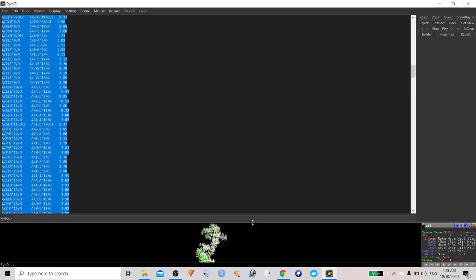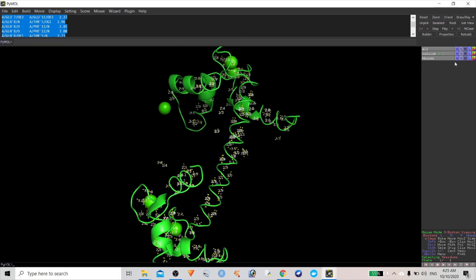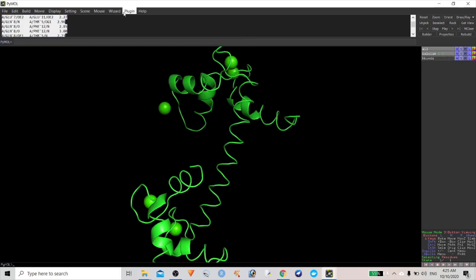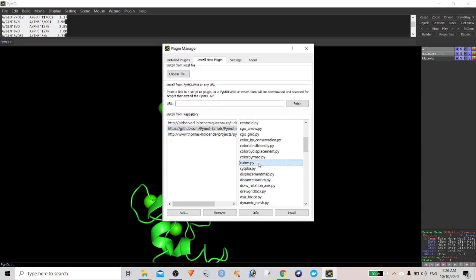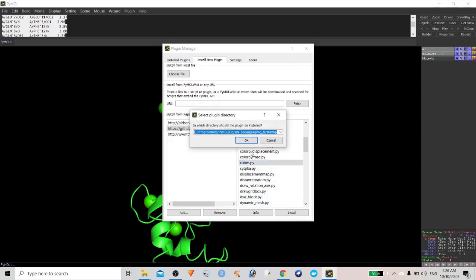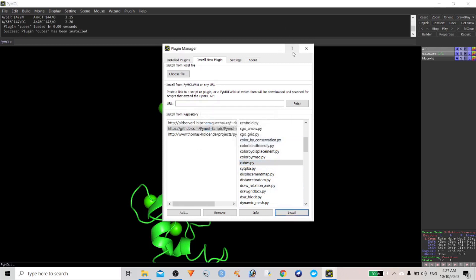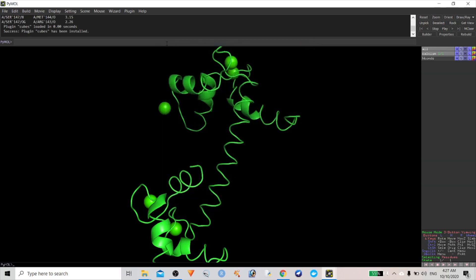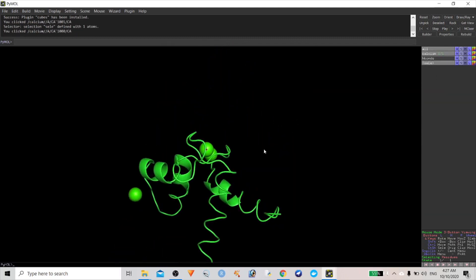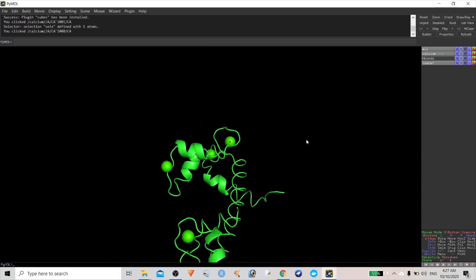This is how we can use this option. Let's hide the hydrogen bonds and install a few more plugins. Let's install the Cubes plugin — the cube representation looks like a very good thing. Whatever you want, for example, if I want a cube-like structure for the calcium ions.